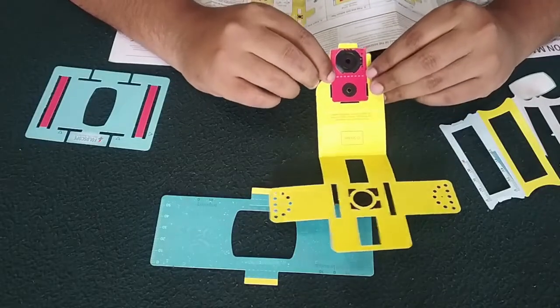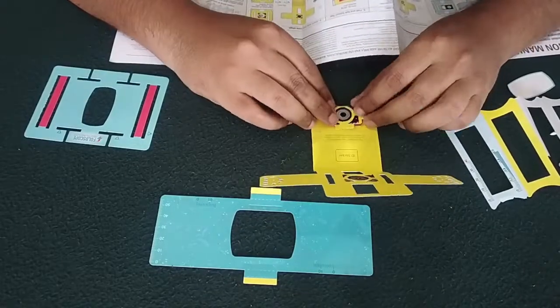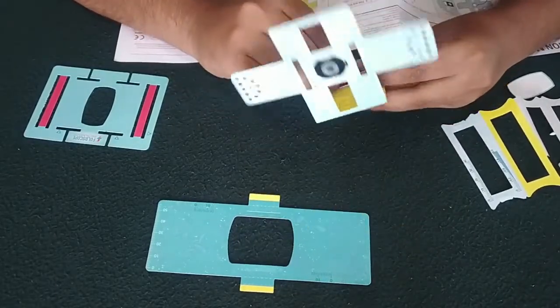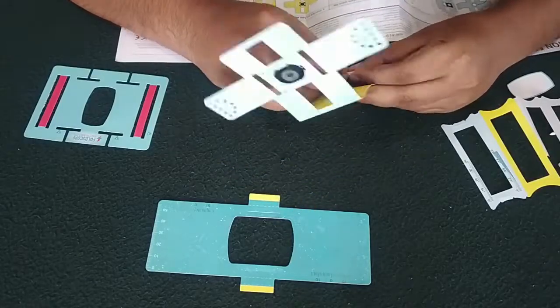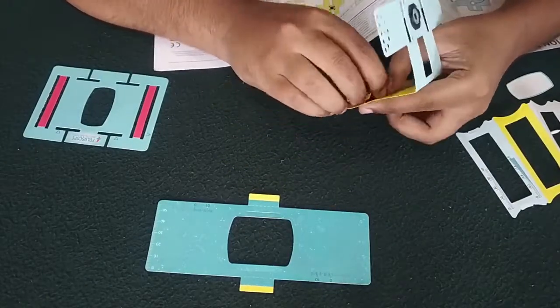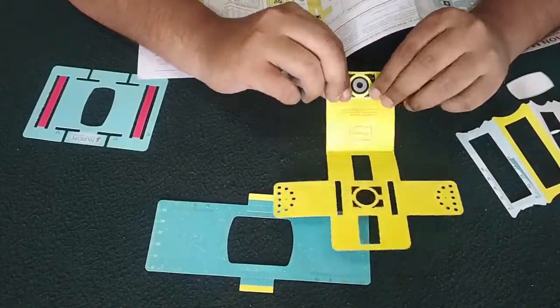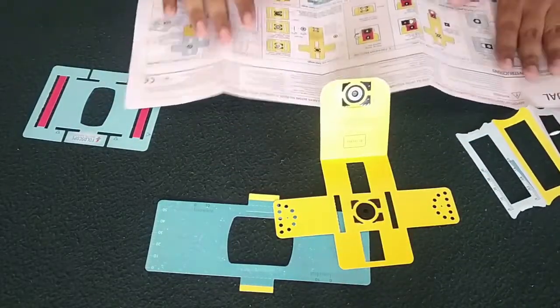Now we need to fold this along the dotted lines, and insert this part through this, and insert this part through this. Now the next step.